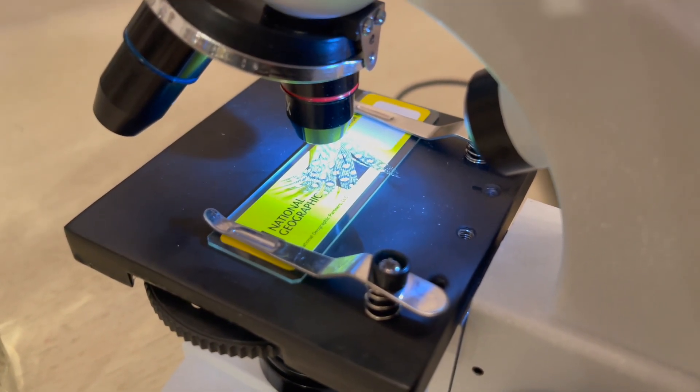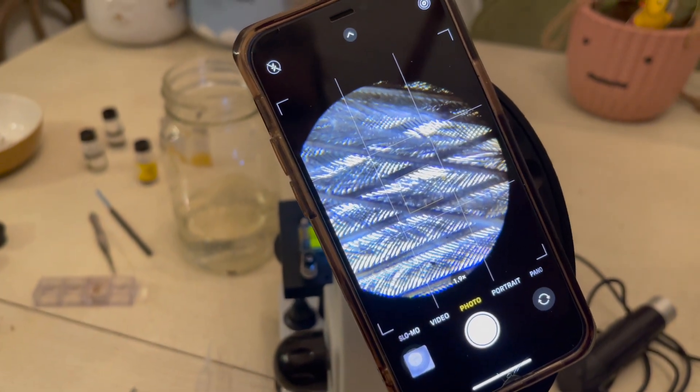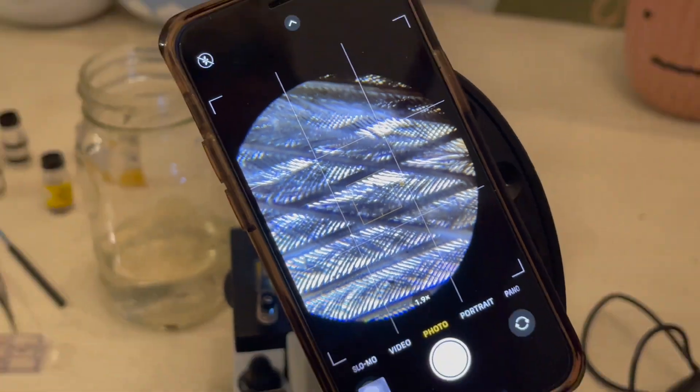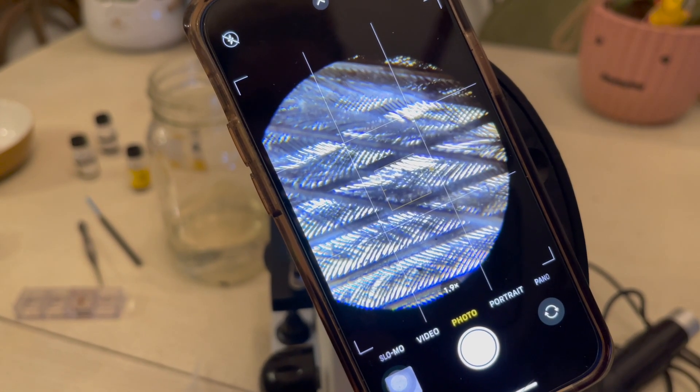The best way to learn how to use the National Geographic microscope is just to start using it. You can adjust the bed, change the magnification, change the light, and then tap on the smartphone adapter to zoom in on everything you're looking at.